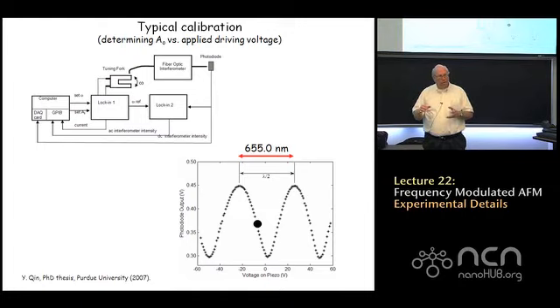So once this calibration is done very carefully in a lab, that calibration number can then be used with pretty high confidence to characterize the displacement of a tine of that tuning fork, same model number, same manufacturer, right? You got it licked. You got the problem solved. You don't have to calibrate every tuning fork that you use.